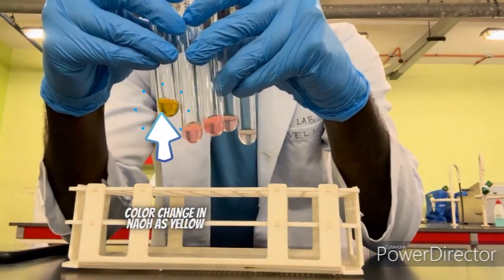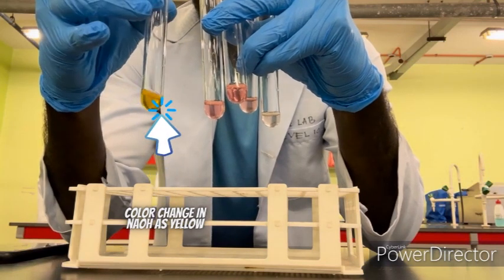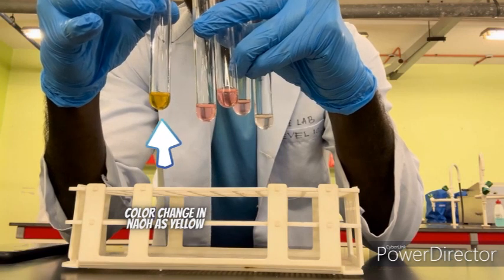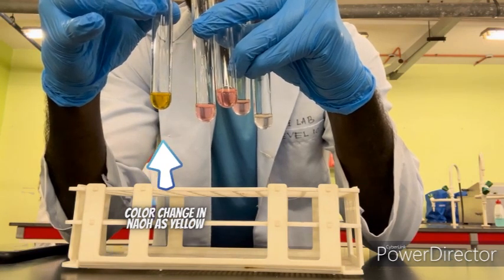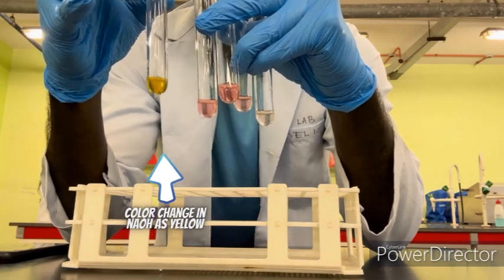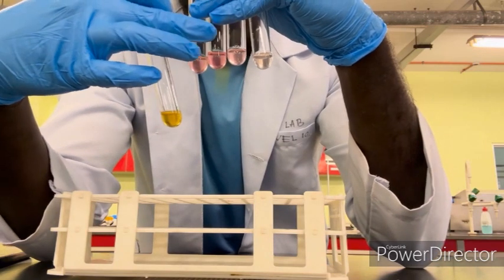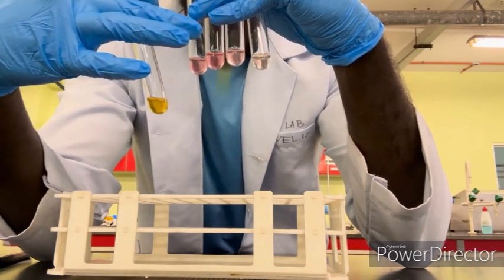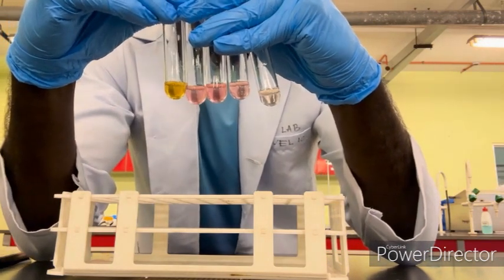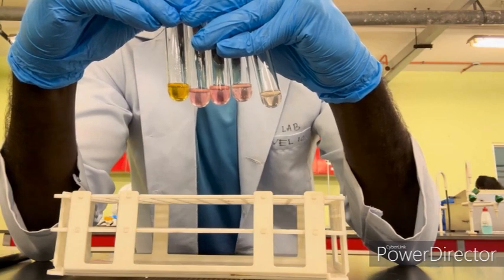And the last one will be the NaOH, 1m. Okay, so we can see there is a massive color change for this part. Once we added our onion peel extraction solution, this one will be yellow color. So we can see for these three chemicals, once we added our onion peel extraction, from here we can know that the higher the concentration, the greater the color changes.